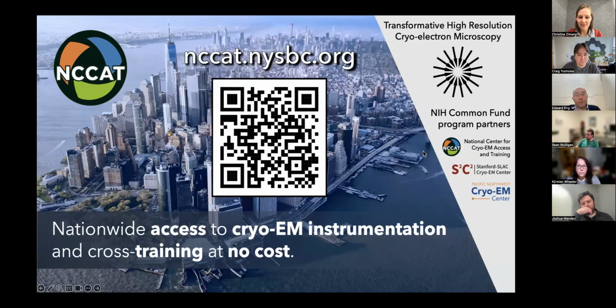Okay, in terms of NCCAT, like the other centers, we offer a robust data collection, screening, and training program. Something that we're trying to do, getting ready for 2024, we're installing a Glacios 2 with a Selectris and Falcon 4i. So not only will we improve and double our capacity for screening, but also for data collection.